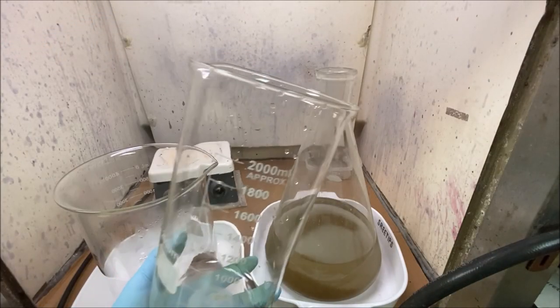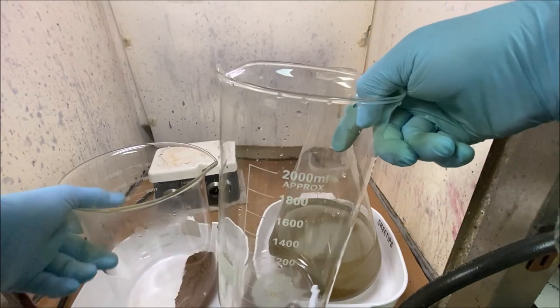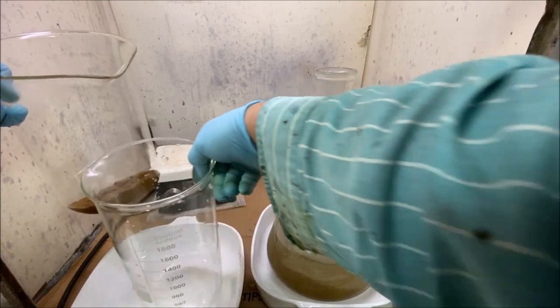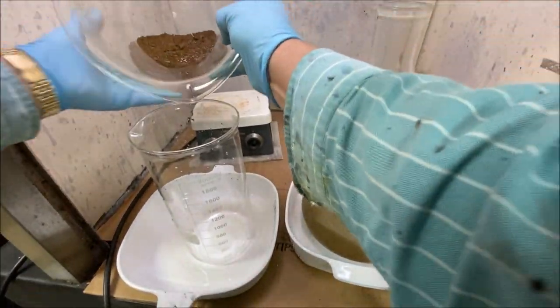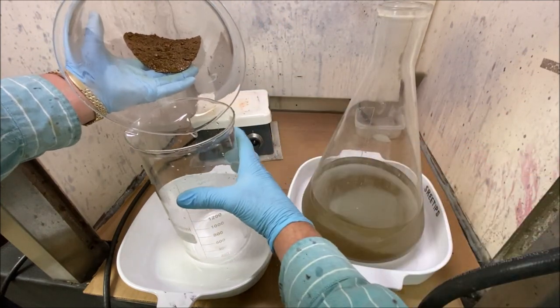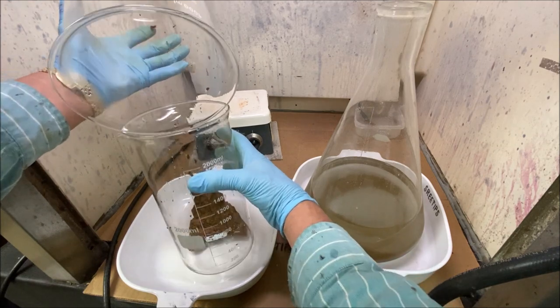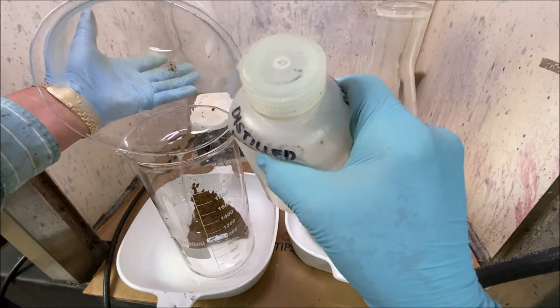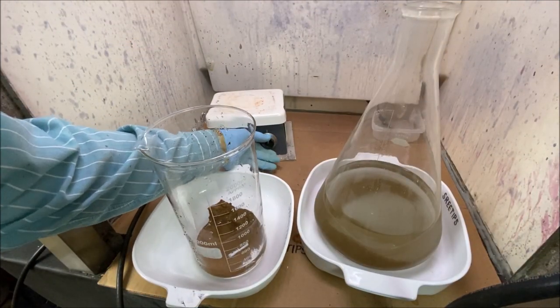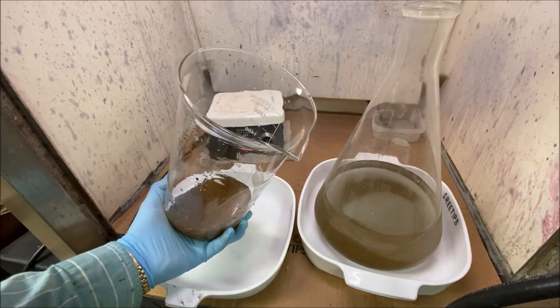I've got this smaller beaker. I'm gonna put a stir bar in here. Now what I'll do is I'll transfer the gold down into this smaller beaker carefully. All right, I'm gonna turn on the stir bar back here and add some heat to our hot plate.